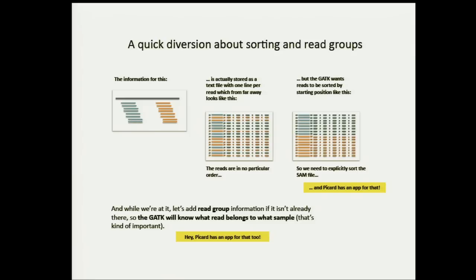Okay, so quick question. We try to use the GATK to do SNP discovery for RNA-seq data. Yep. We also mark duplicates. Certainly, I think. Let me think about that one. I'll come back to you. I haven't done any RNA-seq, so it's something that I need to think about, but I'll get back to you.